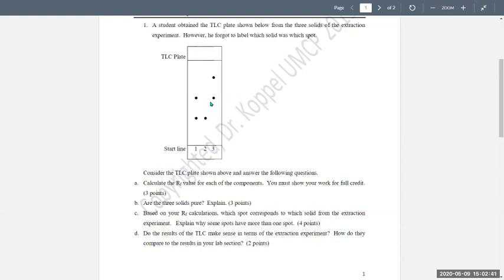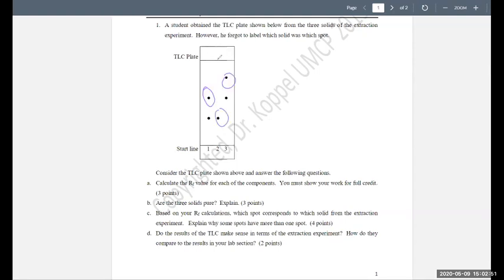And so you can see I have residue. I wanted only this spot, and I only wanted this spot. I only wanted this spot, and this spot, but you can see I have residue of other material, and you should be able to identify those. So my extraction wasn't that great. Once again, I was separating based on what I saw, like layers, so as it drained, maybe some of the residue went down, or maybe I drained too early or drained too late. So you can analyze things like that. And this will also be very similar to the principle of experiment 5.